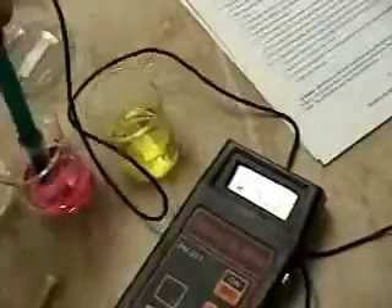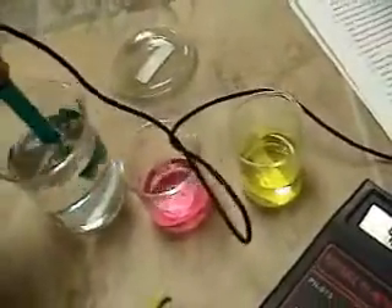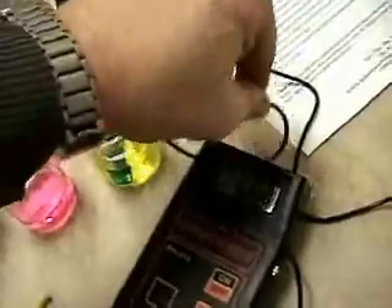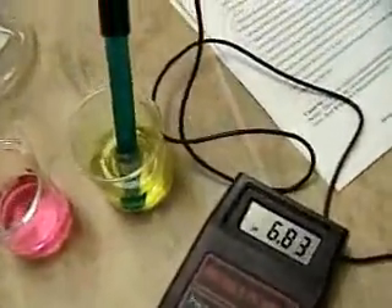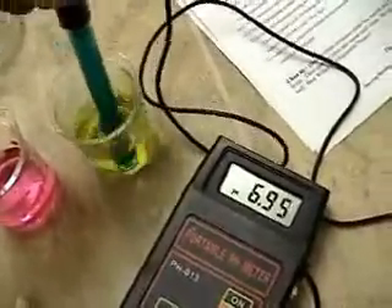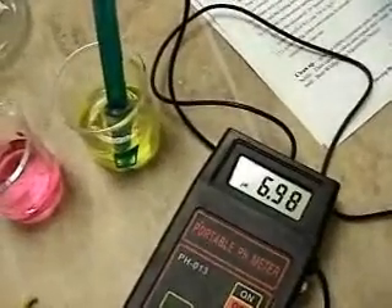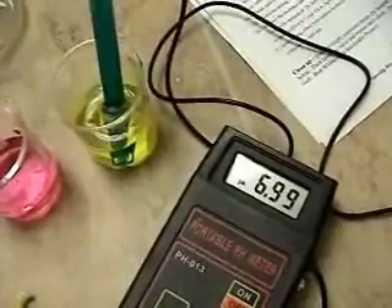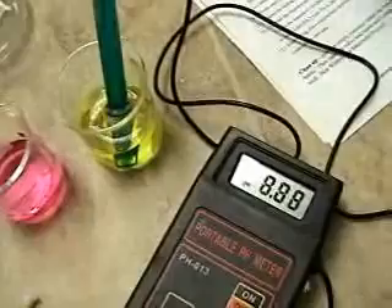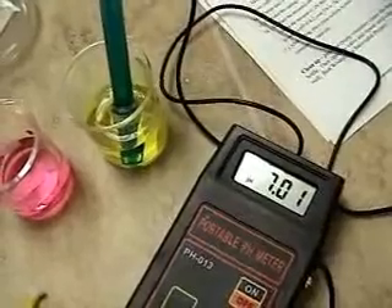Now we're going to measure the high end. We take and rinse our electrode in water and move it over to our 7.01 buffer solution and calibrate at the high end of the scale. You can see it's climbing — give it a little swirl and let it get up there. This electrode looks like it's been hydrated fairly well, so it's going right to the range. That is accurate enough. Notice how it slowed down and stabilized. Now we would call that calibrated.